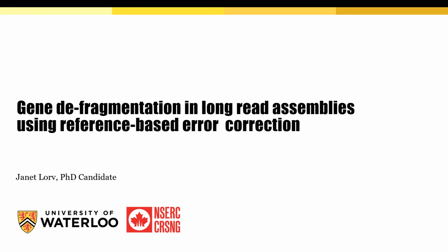And today I want to present to you my work on developing a software tool that uses reference information to defragment genes in long-read assemblies.